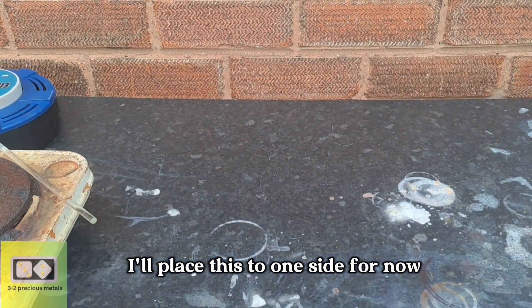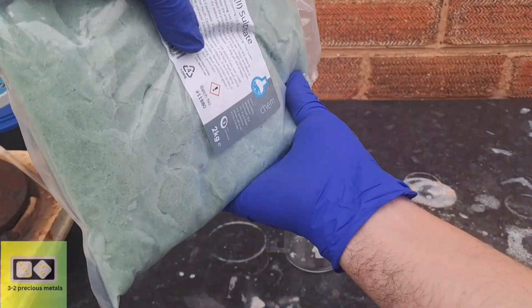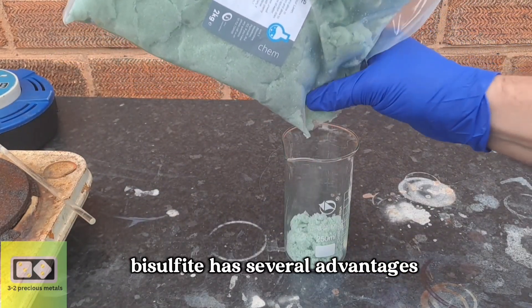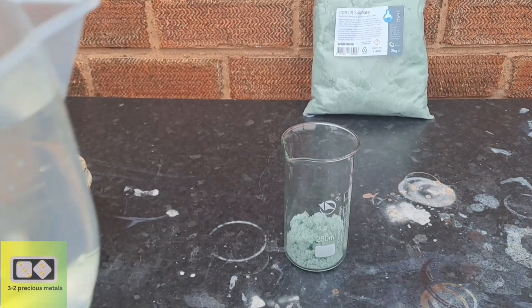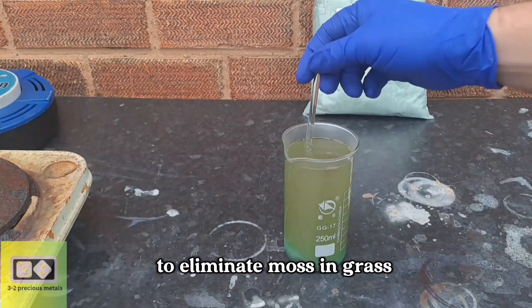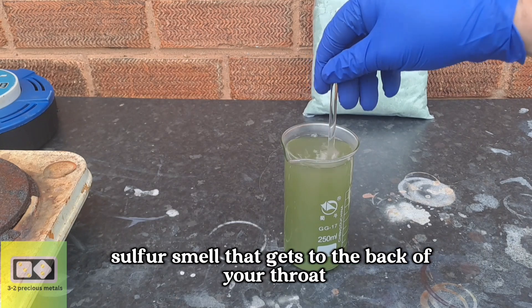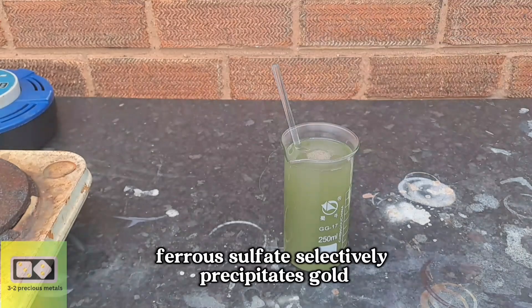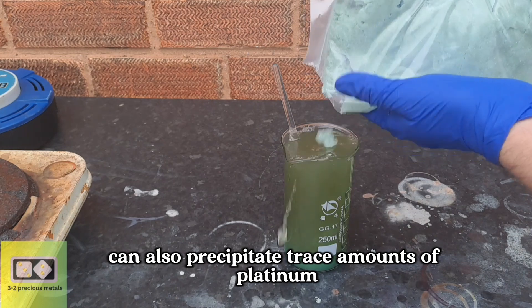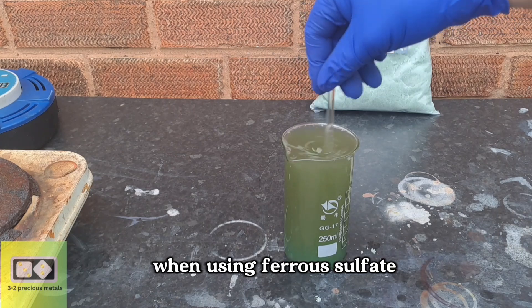I'll place this to one side for now, and I'll prepare some ferrous sulfate to precipitate the gold with. Using ferrous sulfate instead of sodium metabisulfite has several advantages. It is affordable and readily available — ferrous sulfate, also known as copperas, is commonly used in gardening to eliminate moss in grass. Secondly, ferrous sulfate does not have the same strong sulfur smell that gets to the back of your throat. And thirdly, ferrous sulfate selectively precipitates gold, while sodium metabisulfite can also precipitate trace amounts of platinum and palladium in addition to gold. The gold particles also appear to be larger when using ferrous sulfate.